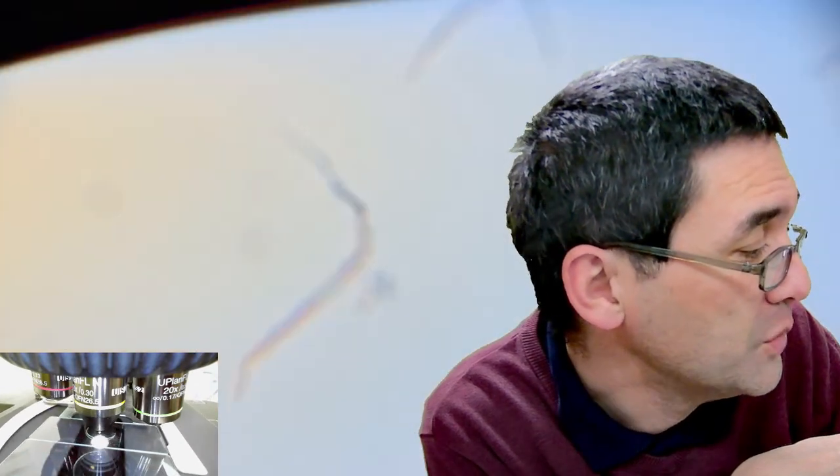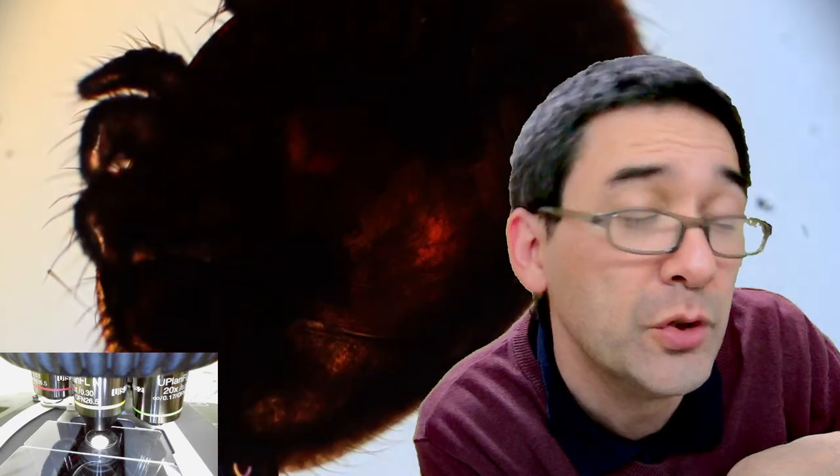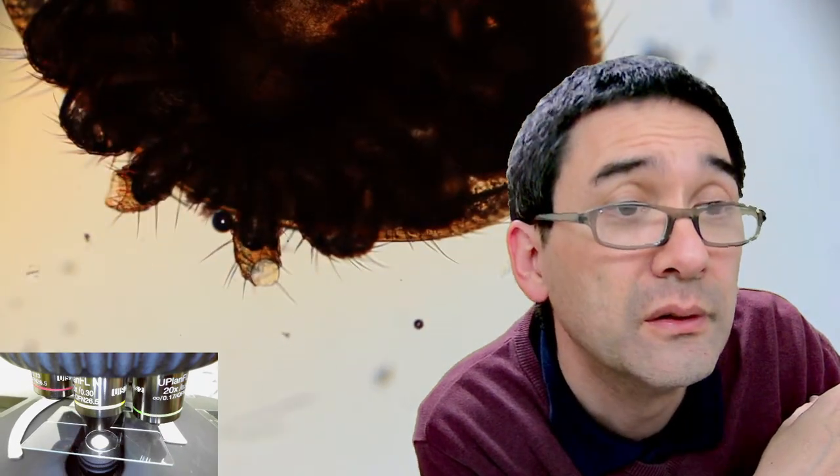And this one is the one without soap water. And look, the bubbles become bigger. So apparently maybe slowly the glue goes into the organism and kind of pushes out the air, which wouldn't be bad really, because then everything is properly preserved. But we'll wait a couple of days until the whole thing is dry.